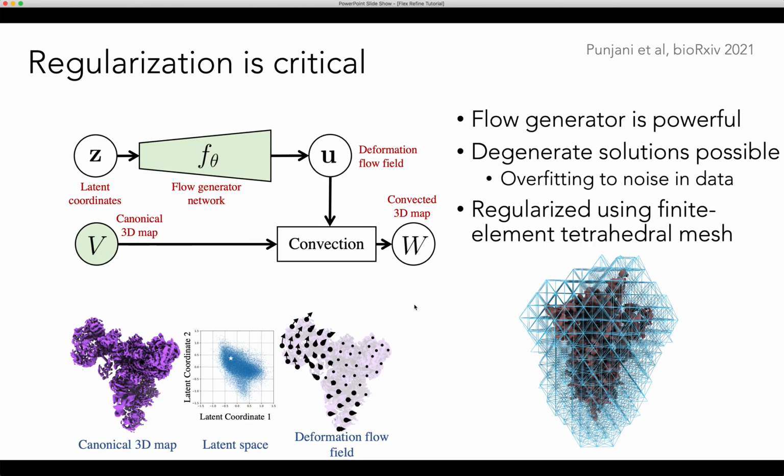With the 3D Flex mesh prep job, we have actually created a method that makes it easy to construct meshes with a custom topology and connections between different regions of a protein using a coarse segmentation of the consensus density. Before you start training 3D Flex, you can create a mesh in this manner, and that's the topic of today's tutorial. We use this method, for example, in some of the newer results that are on the tutorial in the CryoSPARC guide, and those will also be in a paper that's coming soon.